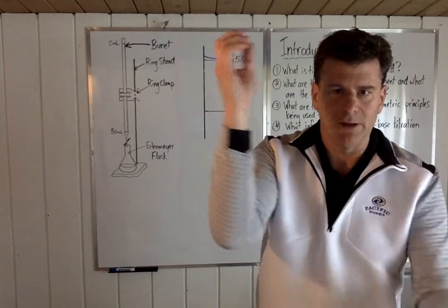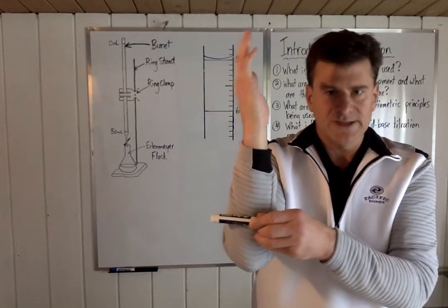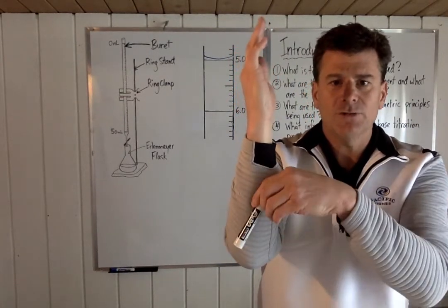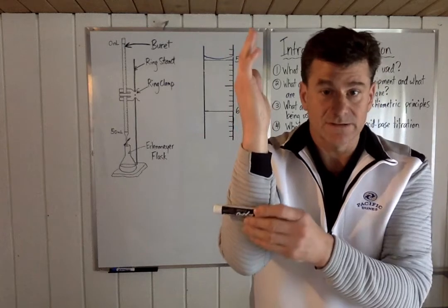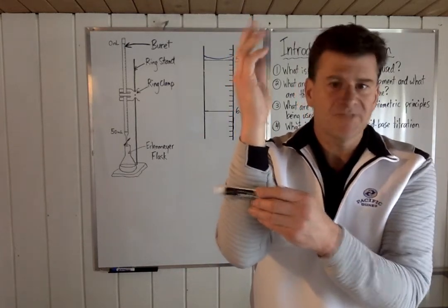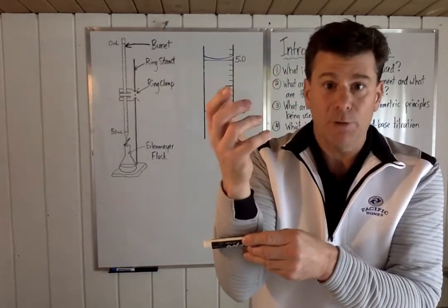It's pouring out the bottom all over your table and the floor and yourself and your books and everything else. So you start with it closed, obviously, and you fill the thing up. However, as soon as you open it, there's a little bit of space below where the valve is. It's just filled with air because there's nothing there. And so what happens is the first, I don't know, maybe half a milliliter of drop that you pour out is actually the air pouring out.